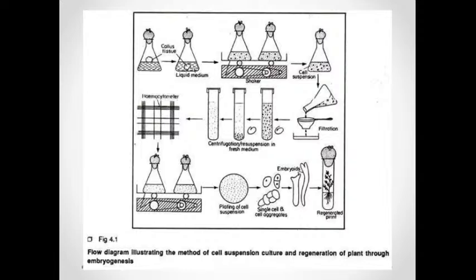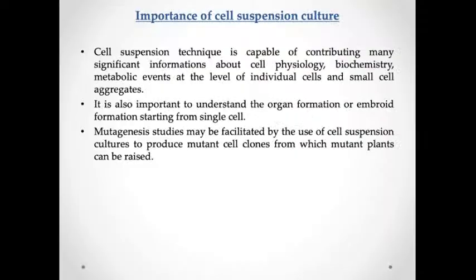Mainly try to remember these figures. These figures are quite important, because if you remember these figures you can explain the culture quite easily in your own words later. So try to remember diagrams. Diagrams are important. So what is the importance of cell suspension culture?